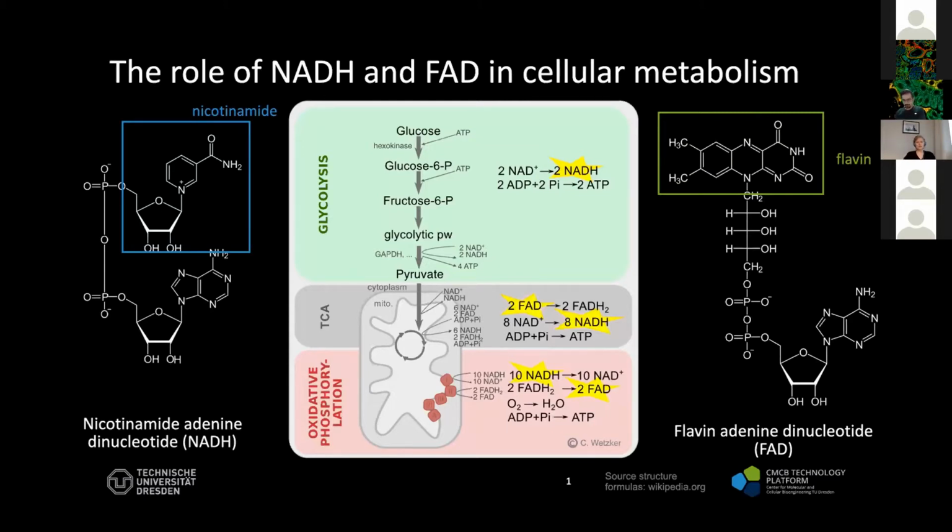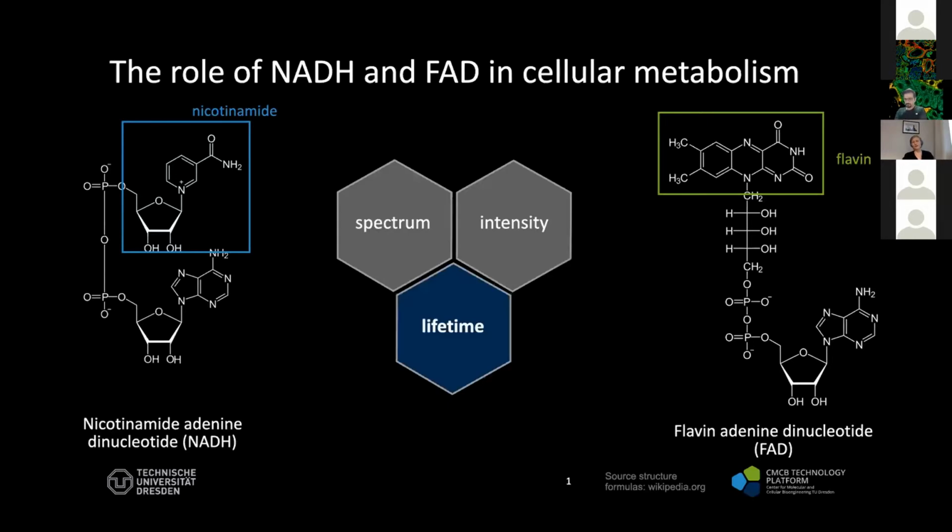And not only are these two molecules intrinsically autofluorescent, at the same time you can consider them as intracellular biosensors, which means that their lifetime is sensitive to the immediate microenvironment of the molecules. In this case, these two molecules are sensitive to potential protein interactions.